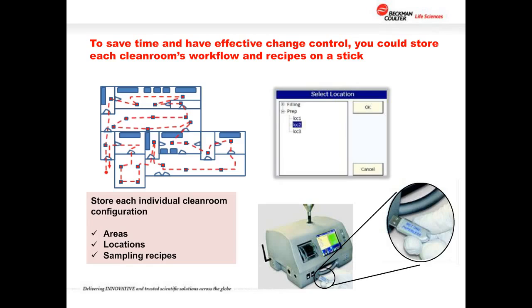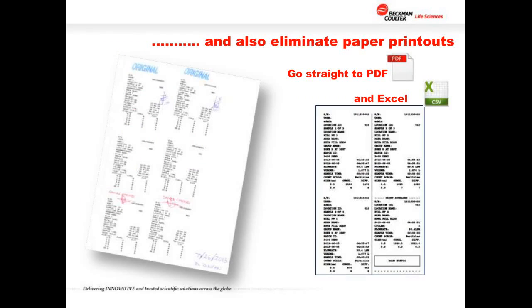So you're certainly taking the reading, the instrument's recording as it might have done previously, but now there's a lot more information available and a lot more information processing available on the instrument itself. So it helps in the whole movement of the information. So eliminate the paper printout, electronically create a PDF in the machine, and maybe an Excel output. That would certainly speed up the overall process.